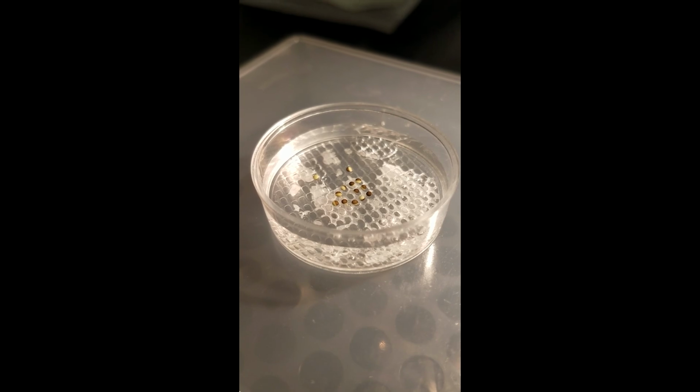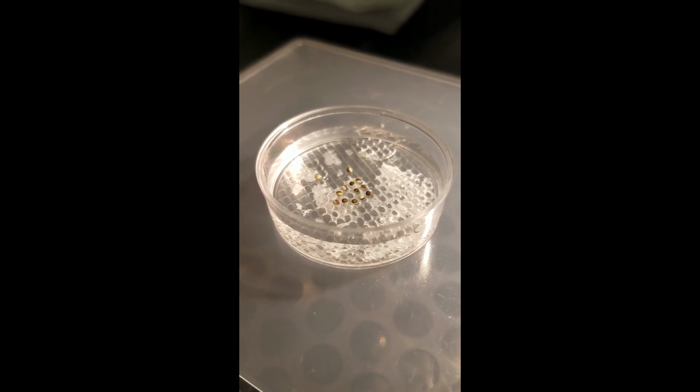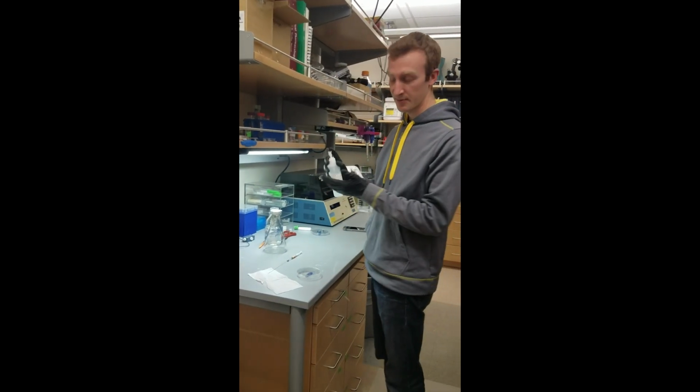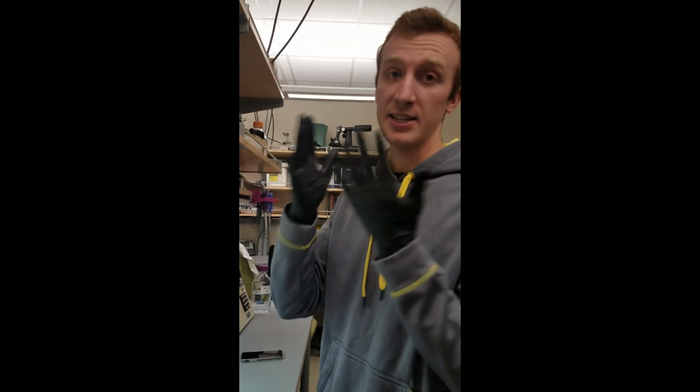Now that you have the oocytes prepared in the dish, clustered in the center so it's easy to keep track of them, and the needle is also prepared and ready to go, our next step is to ready the RNA. The RNA is the last step because it degrades easily, so we want to keep it contained as much as possible and not exposed in the air. The first step is to wash your hands with the RNase out, just to make sure that you don't degrade the RNA with any contaminants.